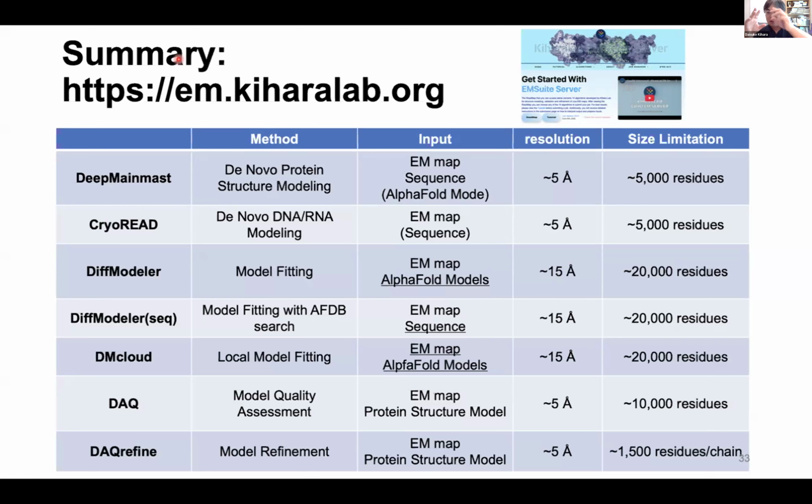It's clear that some of the density needs to be filled with ligands, but the authors didn't do it because it's probably less relevant to the biological questions. So that's another difficulty for tool builders like us.